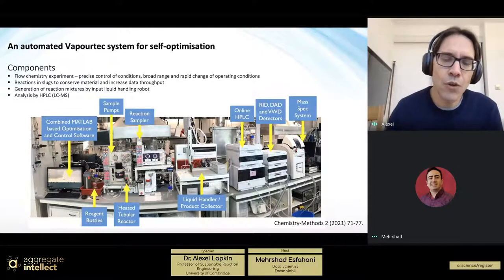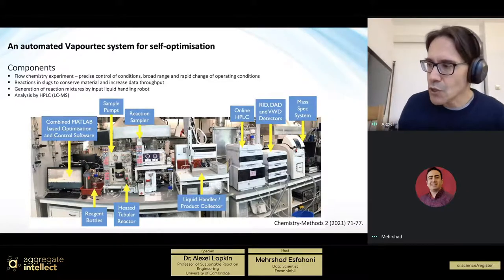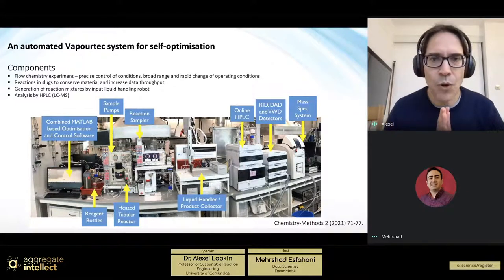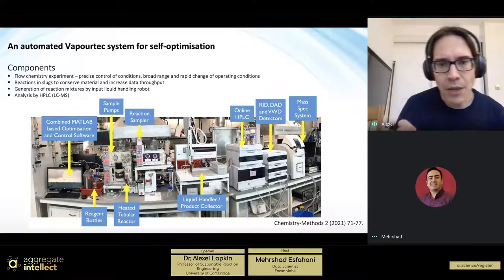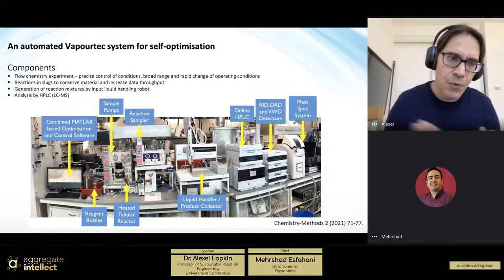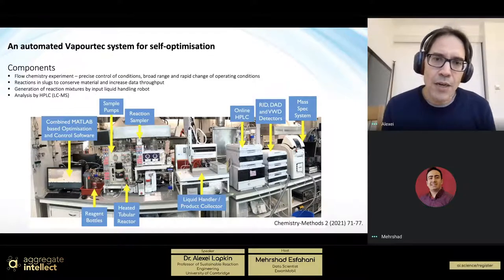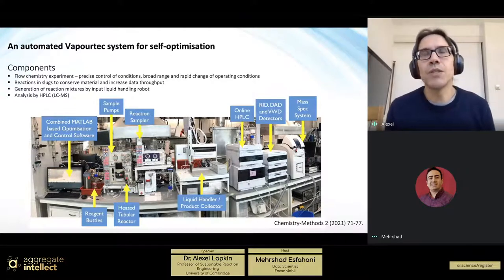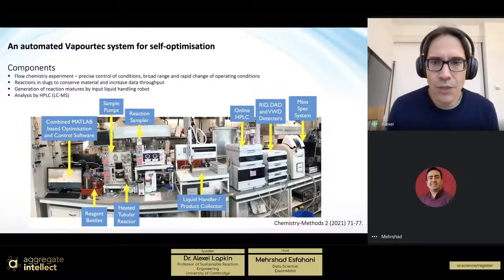The size of the droplet is limited by dispersion in the pipe. If the dispersion is too high, you cannot have very small droplets. So you typically have those quite large slugs. So they are in a pipe, and the slug volume is about 3 milliliters or so. If you go a little bit smaller, then you might have the effect of dispersion on the results.